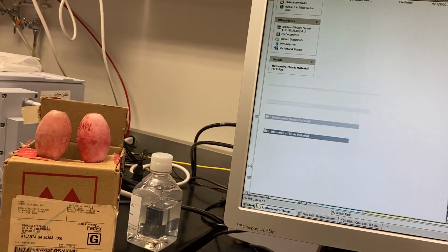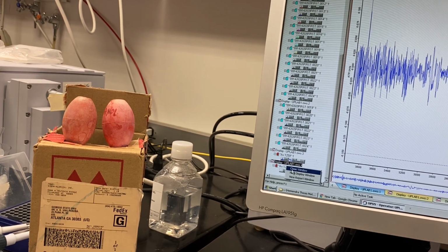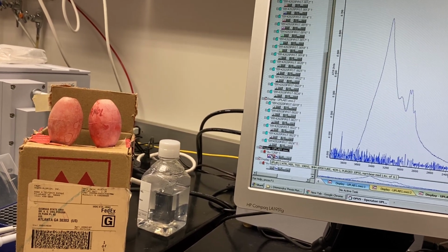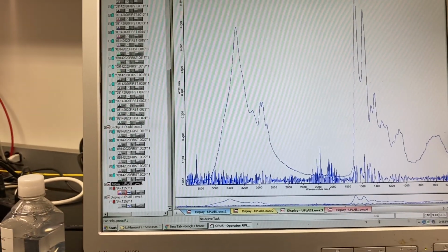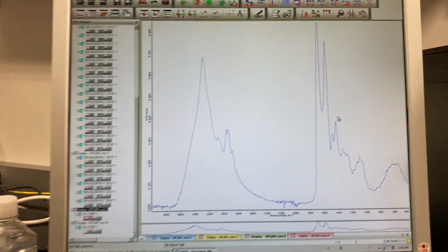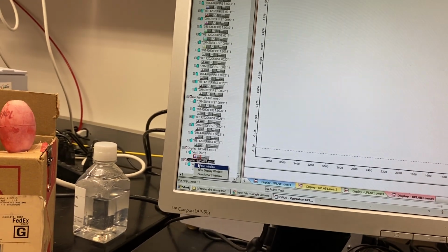So this is the second derivative curve, and we don't need any second derivative curve anymore. I will use that later. So go back here. This is the absorbance curve and the second derivative curve. Go back. We don't need the second derivative, undo. So you got only the absorbance curve, and we don't need the second page, just delete.